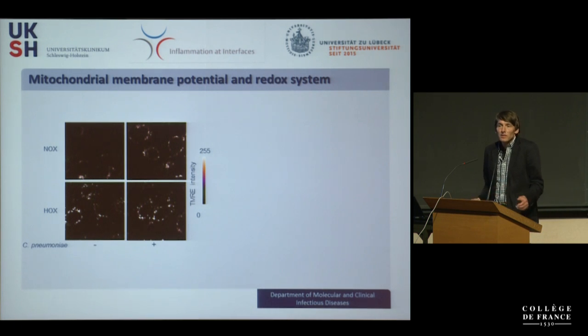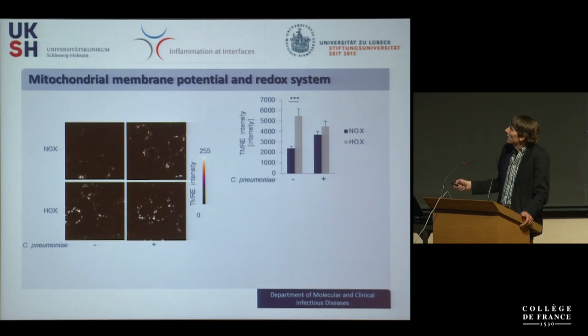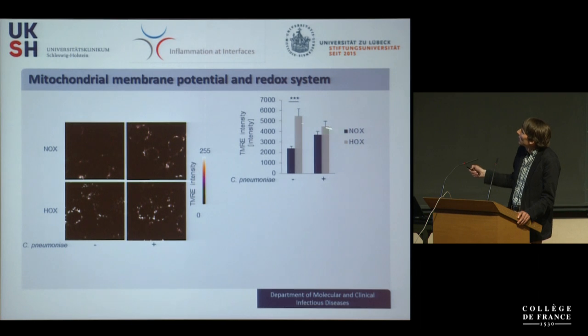One system that has been intensively studied in cancer cells is the mitochondria, and we were wondering whether this, as a potential factor for the metabolism, but also a very important compartment for balancing the redox system, is impaired under hypoxia. What we saw is what is already known: by a very unspecific TMR staining, which is a limitation, under hypoxia you get an increase in the mitochondrial membrane potential if you don't make too severe hypoxia, because then the mitochondrial membrane potential decreases, and we don't have any effect due to the bug which we apply.